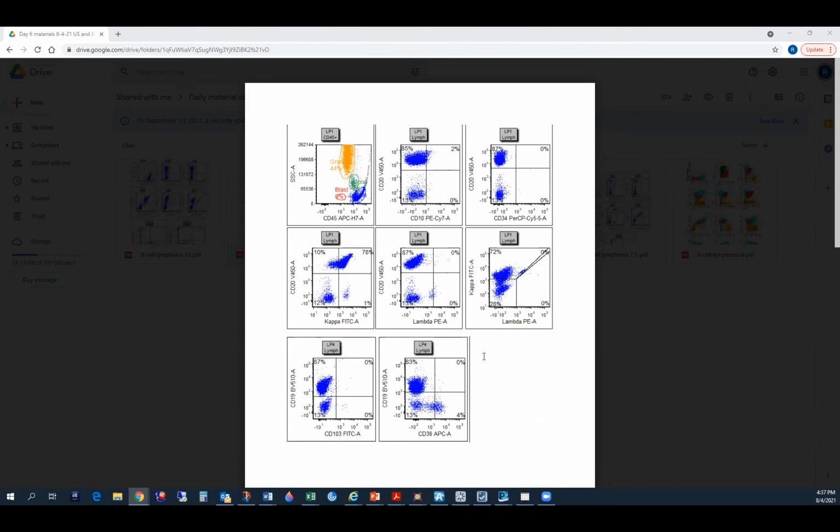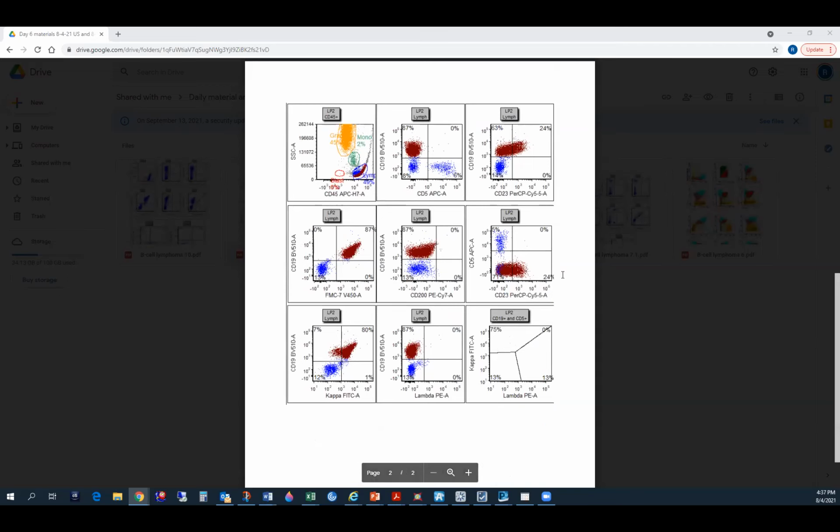When it is 5 negative, the partial 23 positivity is not abnormal. Even in normal lymph node or lymphocytes, you will have partial 23 and partial 200 positivity. That's okay. It becomes relevant only if it is 5 positive. I have always seen this 23 as a smearing type of population. Yes, that alone has no significance. Especially you have to see if it is expressing 5 and if it is monoclonal. Only then it is significant.